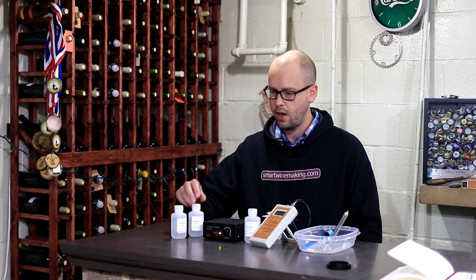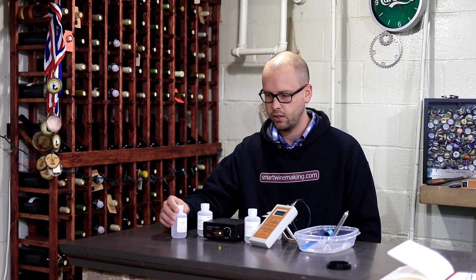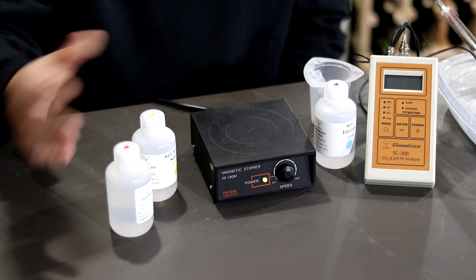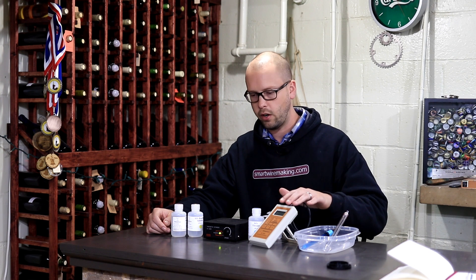This is something that maybe you split on with some winemaking buddies. If you have a winery it's a pretty cheap thing. When you buy the chemicals — acid solution, reactant, and titrant — those are going to be about just under $50, but you can run about 50 tests with it. So you're looking at about a dollar a test, which is about the cheapest you can run a test.